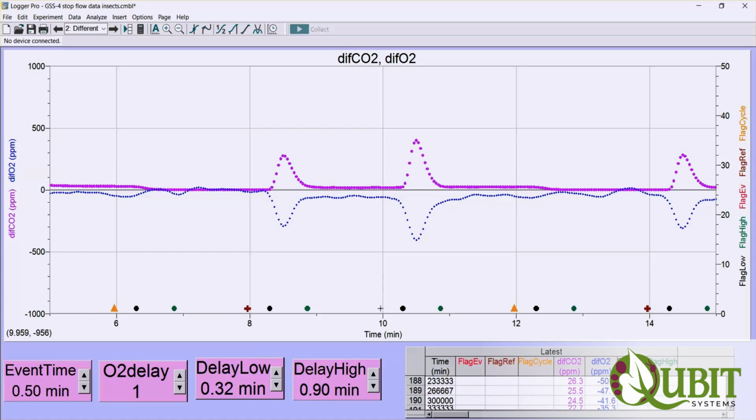So it's a time parameter that's set from the end of that dwell time towards the beginning. This time period usually represents about a quarter of the dwell time, and you have to ensure that it falls on the steady state of the CO2 and O2 signal after the peak has already flushed.